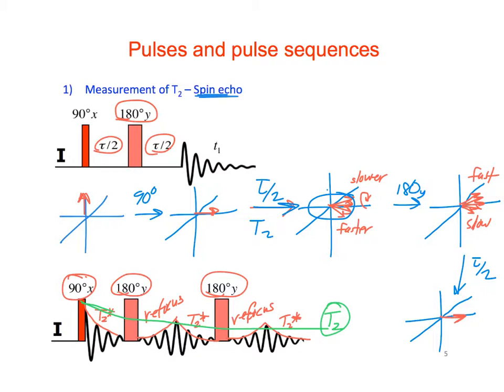But what I don't know here is how you actually take this kind of data and actually calculate the values. I guess at some point along this, maybe you have to change the number of 180s you do and then acquire and then run an experiment or something.